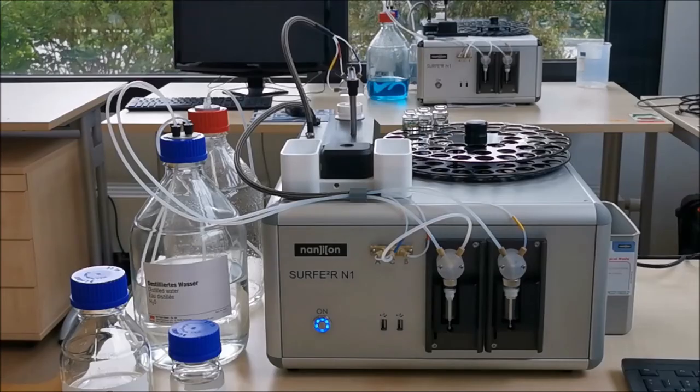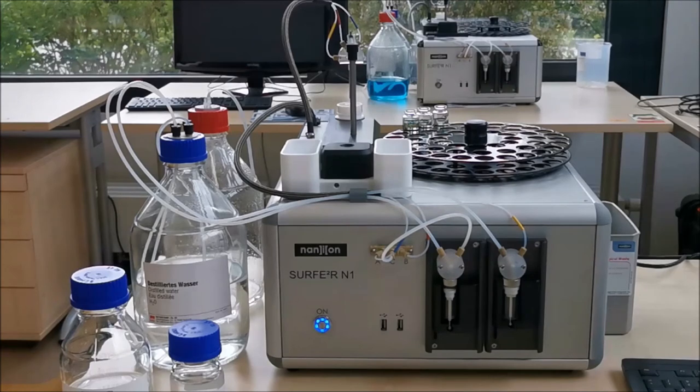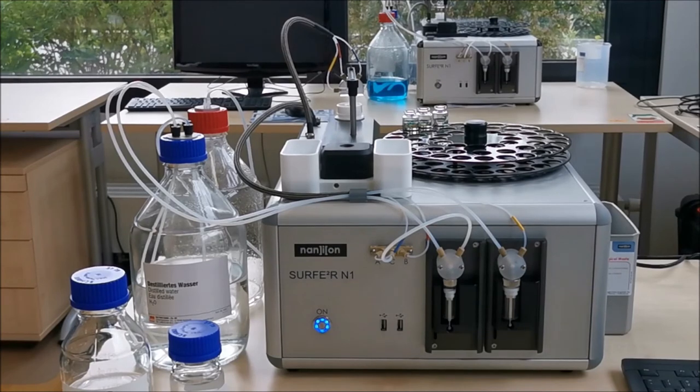By the way, this video recording is in real time since the start of the experiment. One single measurement takes about 3 minutes. The instrument now finishes its initialization procedure before continuing with the second measurement. It also cleans the liquid handling components.